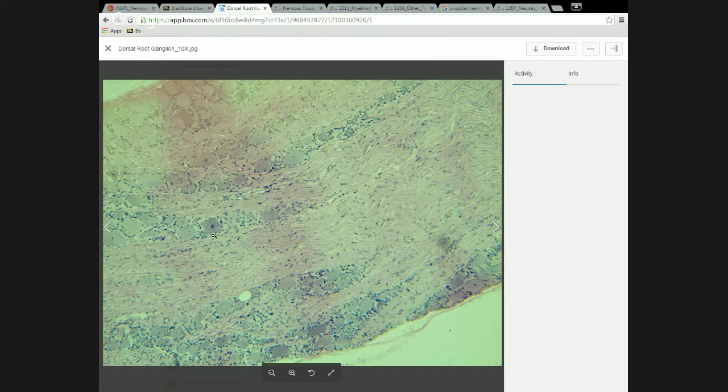But understand, somewhere there's an axon coming off of this, which comes out into this area and splits, and half of it goes one way and half of it goes the other way. Now, again, it's sort of my own personal convention. I usually think of the left side of the picture as the side that's going to the periphery, so where the dendrites are going to be. And then the right side of the picture is going into the central nervous system. I don't actually know how this particular ganglion is oriented. It doesn't really matter, but my way of describing it kind of keeps the story up.